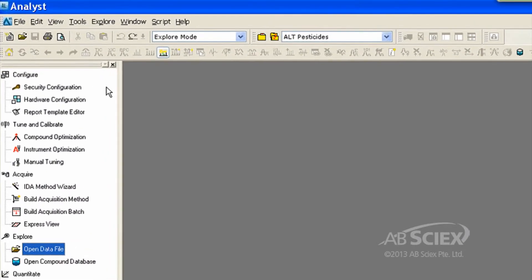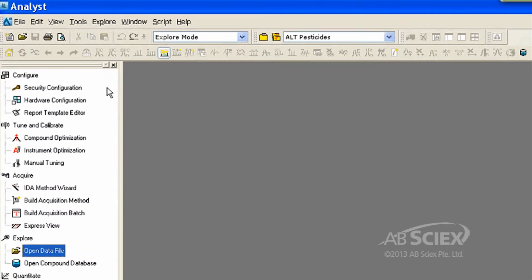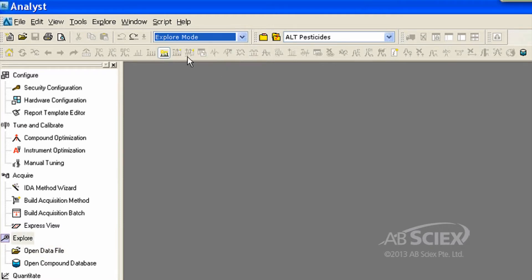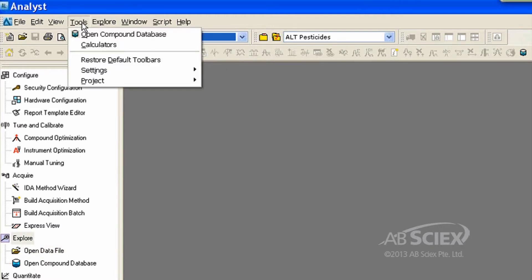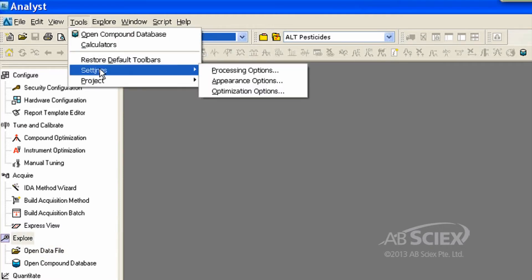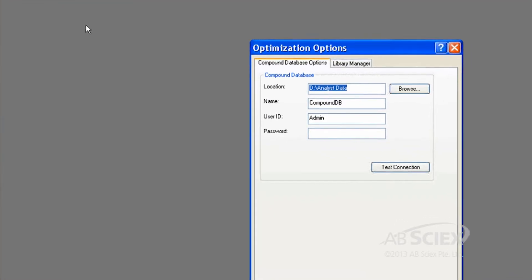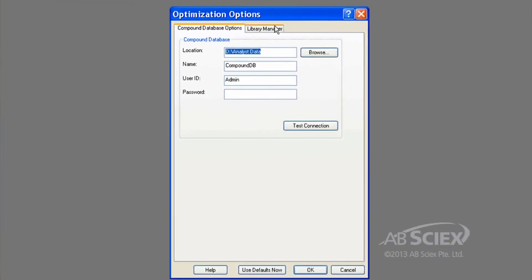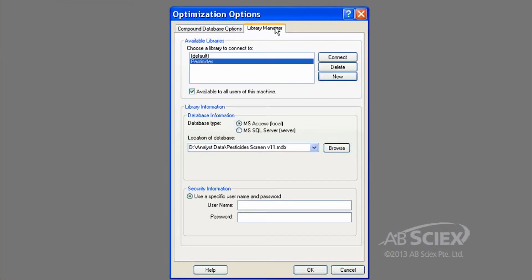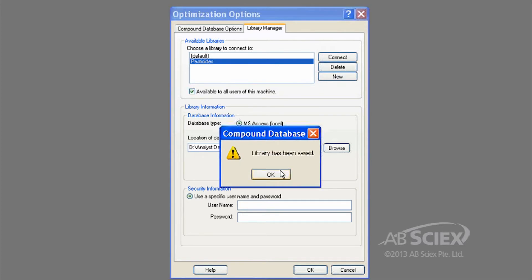Step 1: Activate your MS-MS compound library by going to Explore mode, select Tools, Settings, Optimization Options. In the new window, select Library Manager and choose your library. Here we will choose our pesticide library, then click Connect, and finally click OK.